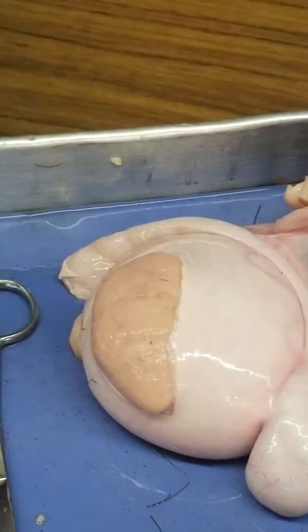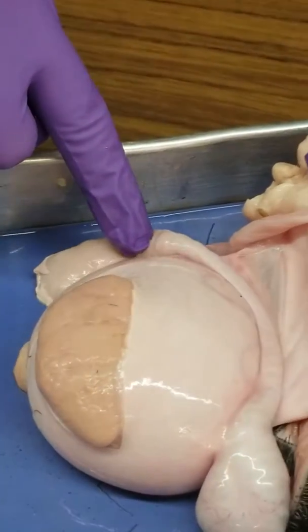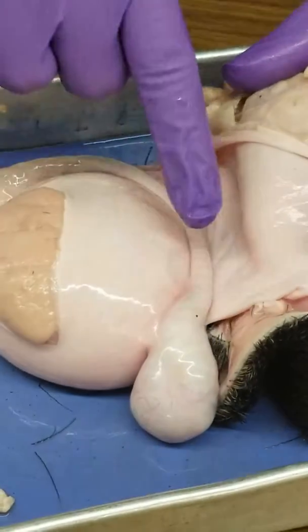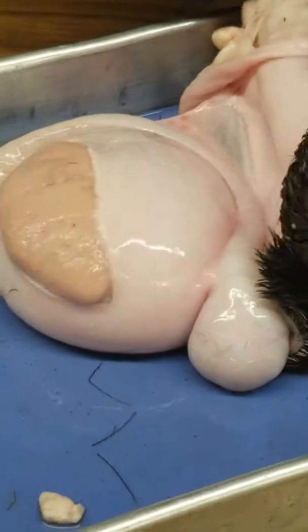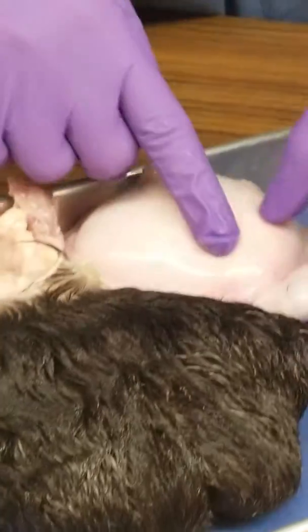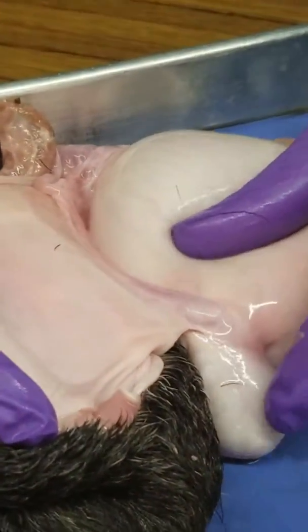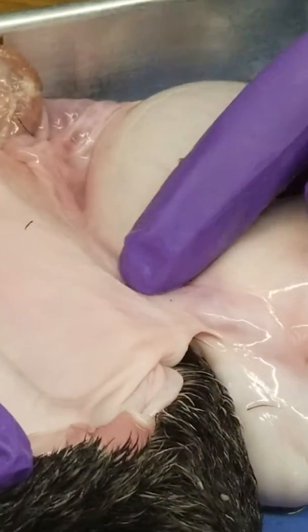Seminiferous tubules protruding out. Here you have the head of the epididymis, then the body of the epididymis, and then the tail of the epididymis right here. You see that it curves — curving up on the other side to the vas deferens, or ductus deferens, right here. So the tail of the epididymis going up to the vas or ductus deferens.